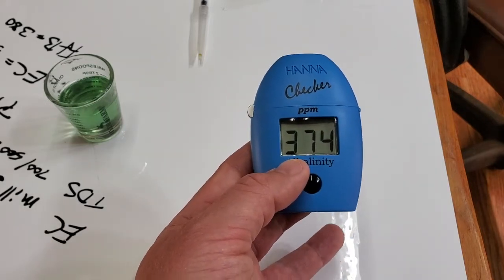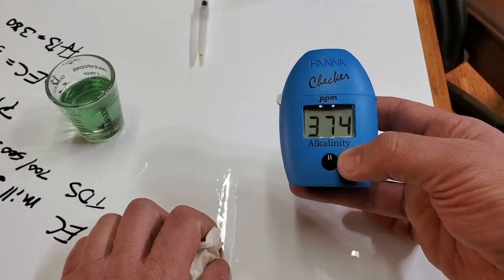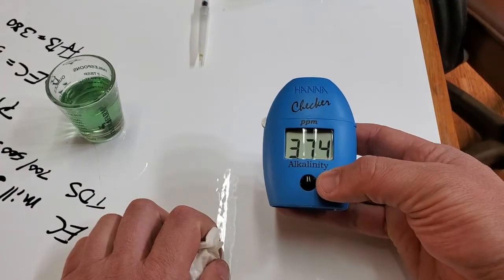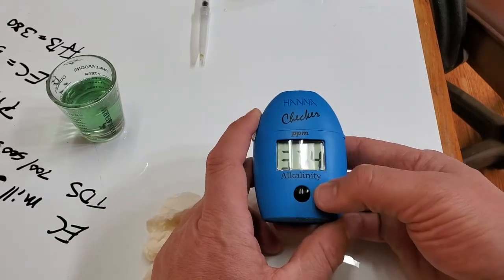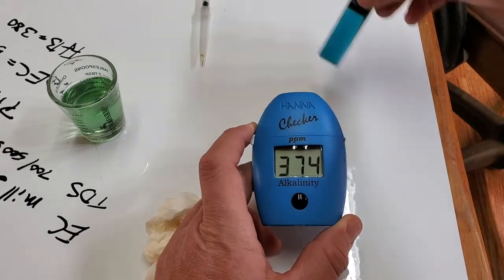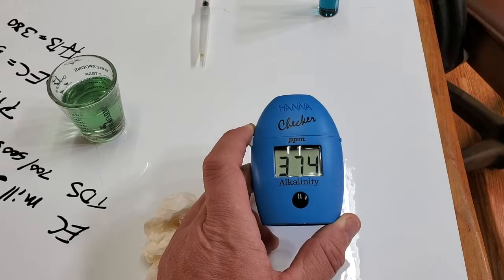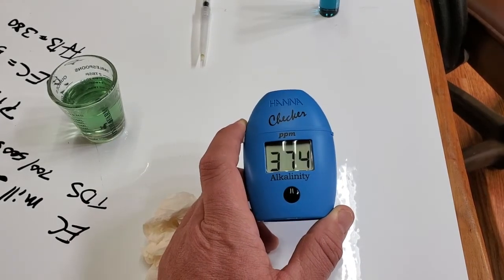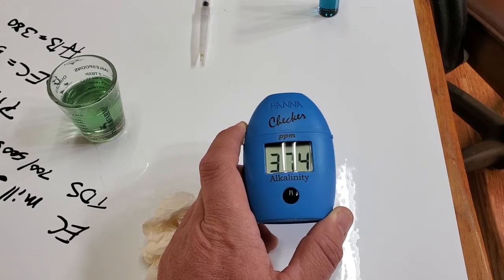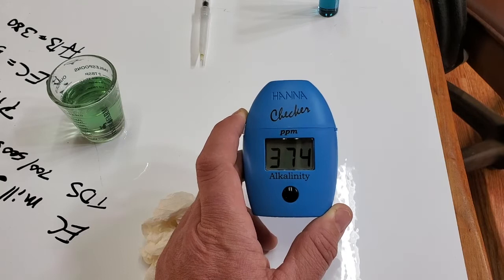374 — this is actually my house well water, not the RO water. I tested my RO filter earlier and it came out at 124. This unfiltered, untreated well water is reading 374, which is very hard water.